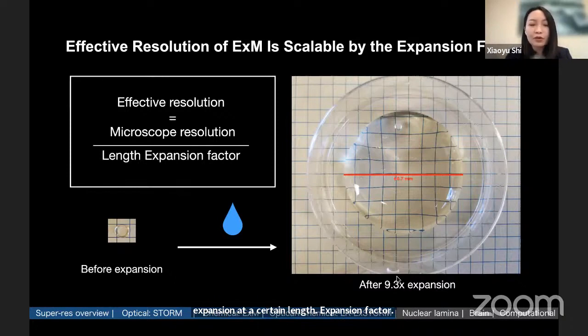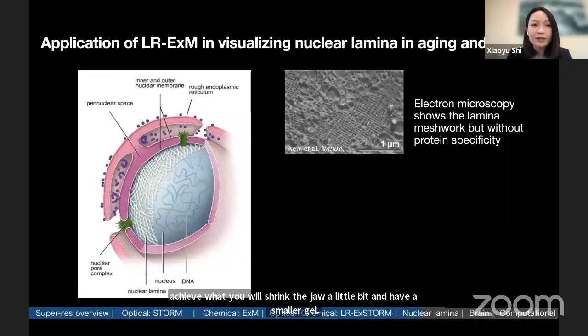Now, if you use pure water, you expand your gel maximally. That is defined by the gel formula. But if you use a slightly salted buffer, you will shrink the gel a little bit and have a smaller gel. It really depends on what you need eventually.